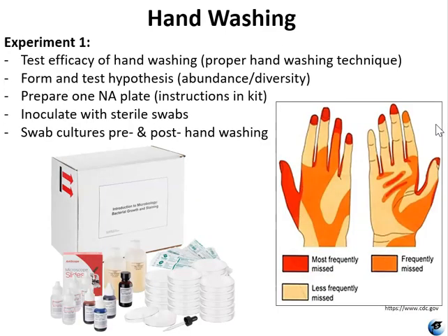So for experiment one, we're going to be testing the efficacy of hand washing. But first, I want to show you this figure here on the right. It shows you where most people tend to miss when they wash their hands. It's extremely important to learn the proper hand washing technique. Even good hand washers miss places like in between their fingers and the little cracks and crevices in the palms of their hands. So what is the correct hand washing technique?